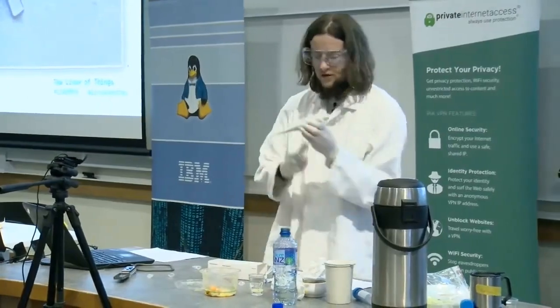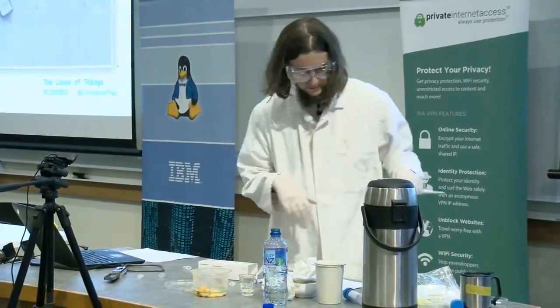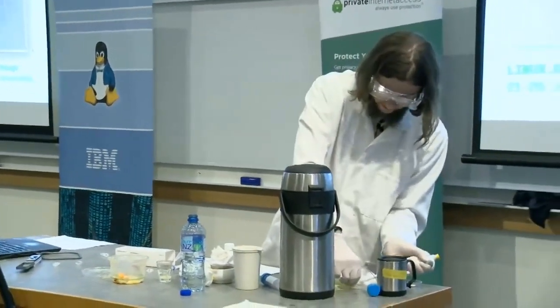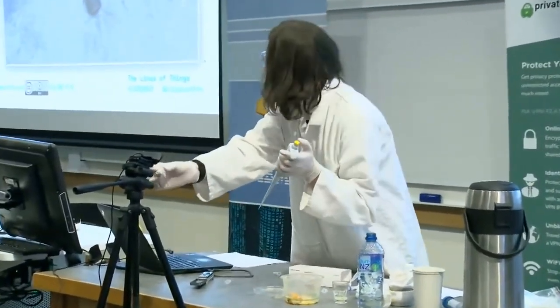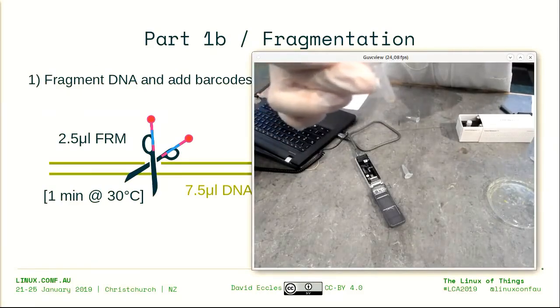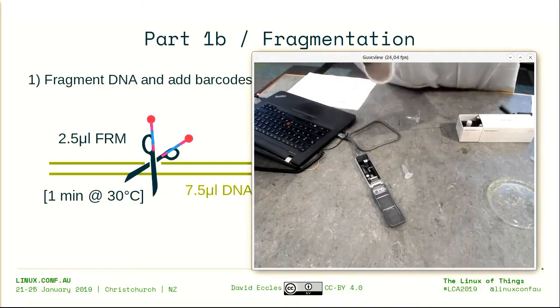Okay, and the next one is the sample from last week. This sample is a bit brown. That's not the sample's fault. I actually put some magnetic beads in there, and I wasn't able to pull them all out. But magnetic beads shouldn't be a problem for the sequencing.